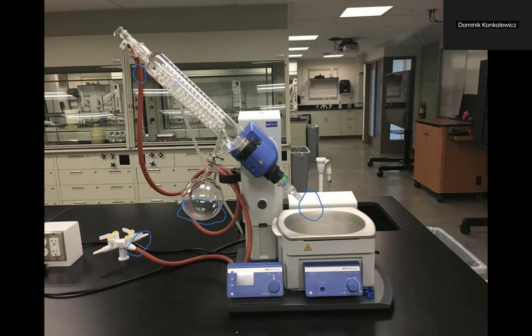Key thing is at the end of it, we can turn off the rotovap. It'll be rotating just to help mix it. Stop the rotation, break the vacuum holding the flask here. Then we can take it off and collect our caffeine at the end and do our analysis on it.